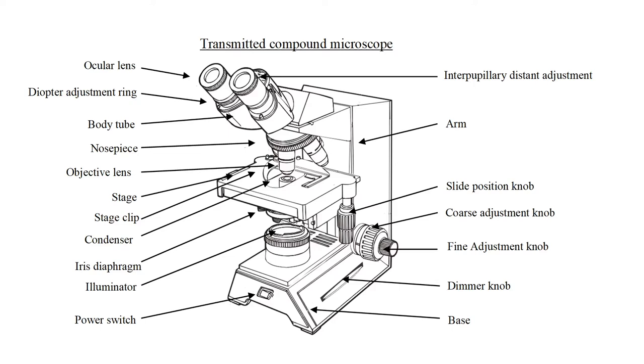Let's begin. Power switch, ocular lens, objective lens, stage and stage clip, slide, position knob, condenser, iris diaphragm, base and arm.